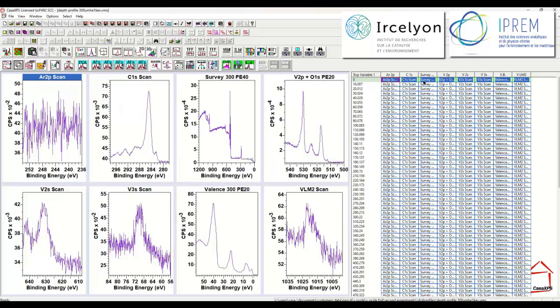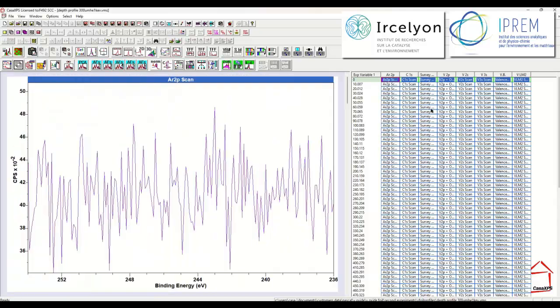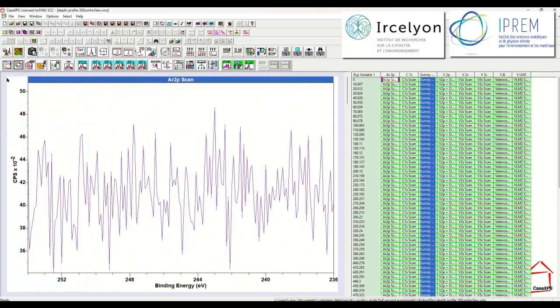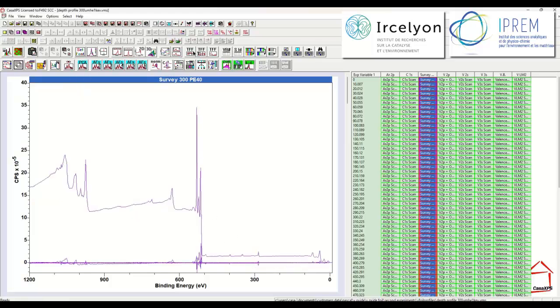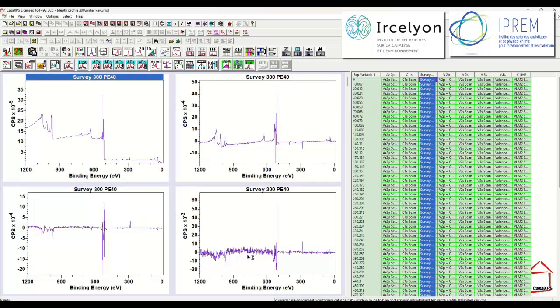Now, the problem I have is that I would like to use the survey measurements because these are the only data for which I have background as well as photoemission peaks. And although when I do a PCA on these data it throws up a set of abstract factors, these are too numerous and probably more involved than I actually need to consider in terms of understanding the sample.